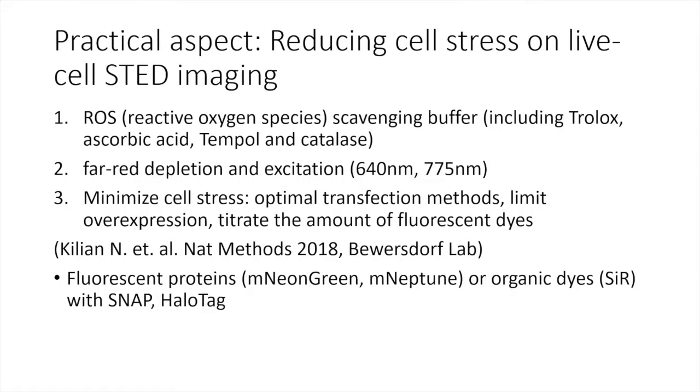And the second part, if you want to do live cell STED imaging, just make sure your system is good for live cell, to keep cells alive and happy.